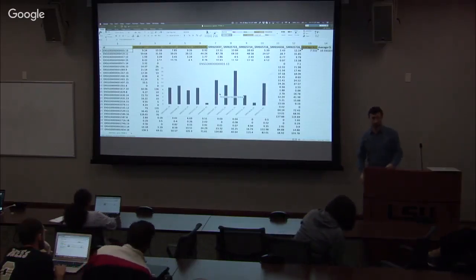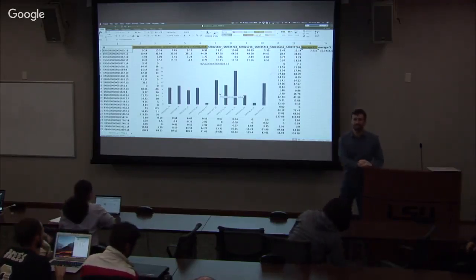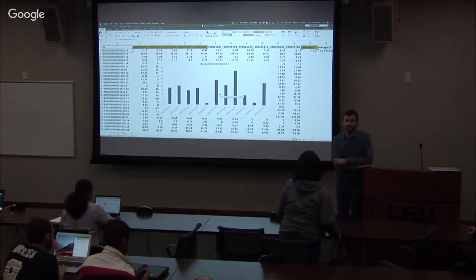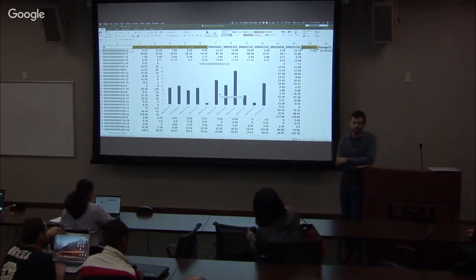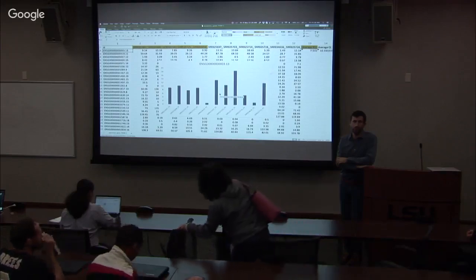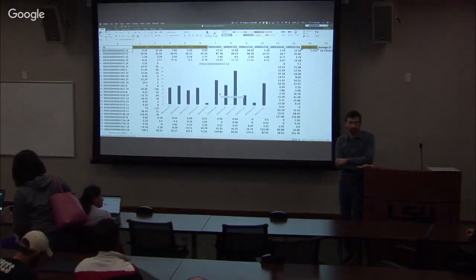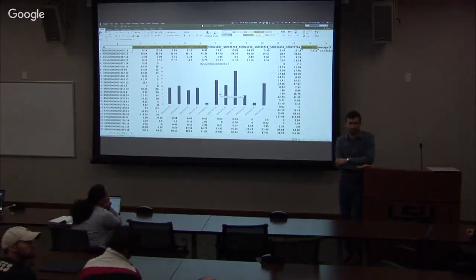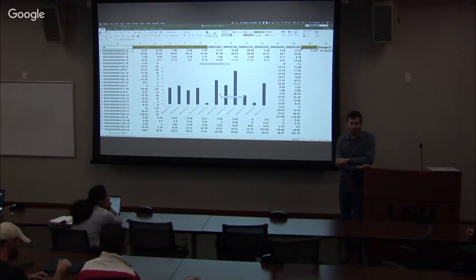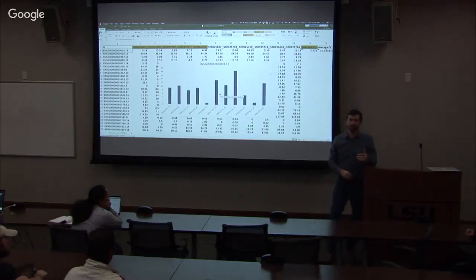Okay. Well, I have one. So when you said about inspecting the mapping statistics, and then you showed that there was variation there, and some genes that you take into account, right? How do you take it into account? Yeah, how do you? FPKM and TPM. Yeah, so that was my second question. After you normalize, are you sure you can compare those? I mean, that you take off this variation? No. Because that is just one way to normalize, is look at the total number of reads.